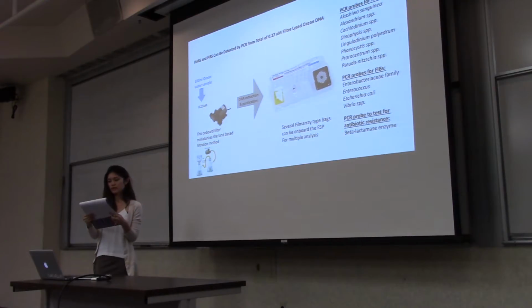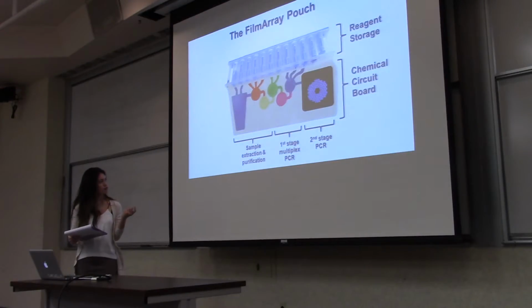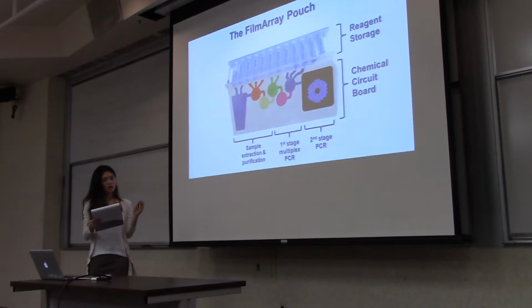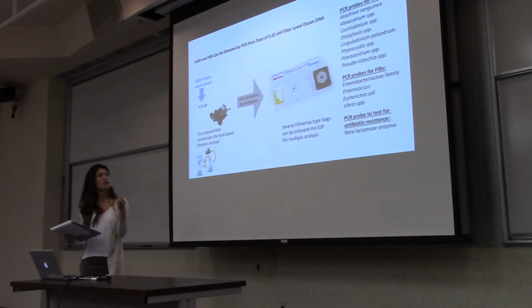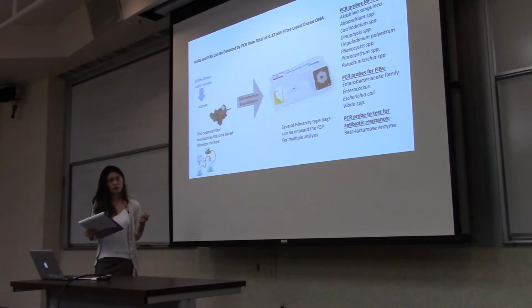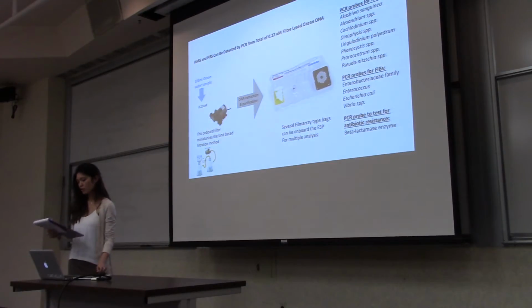Once the sample is collected and filtered, it will go through these steps, and also the list of the organisms that we have collected in the past few years will be inserted into the reagent storage.